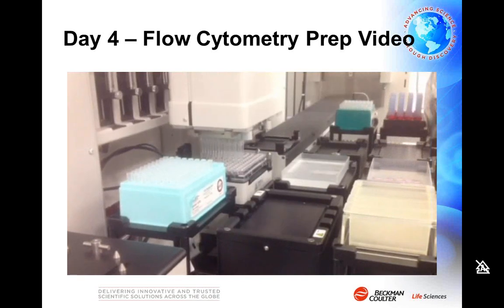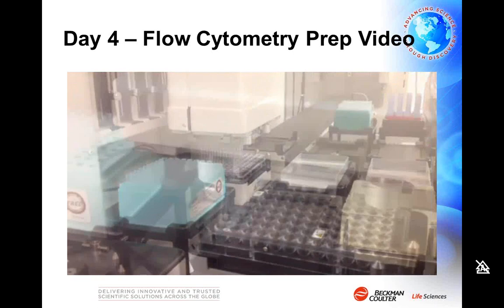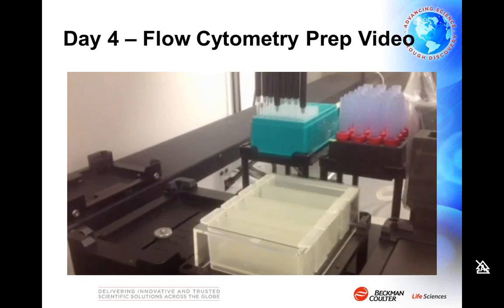The plate would then start shaking and shake for 30 minutes. We'll only show it for a few seconds here for demonstrations. And then every 10 minutes we would do 40 pipetting steps up and down, basically just trying to dissociate the sphere, which again is much easier to do in an automated 96 wells at a time fashion.